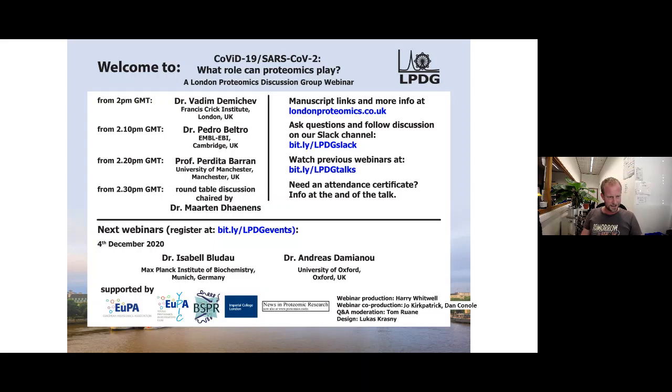So maybe let's go into a few more technical questions because those are the main ones coming in the Slack. Vadim, to you first. It's a recurring question that people in intensive care seem to be on some kind of serum dilution. I'm not a doctor, so I was not aware, but I can imagine how that can impact results severely. And I think it might relate to the famous cytokine storm that has been known. These are two very invasive changes in the plasma. How do you either normalize or handle these, or are you additionally confirming these phenomena?